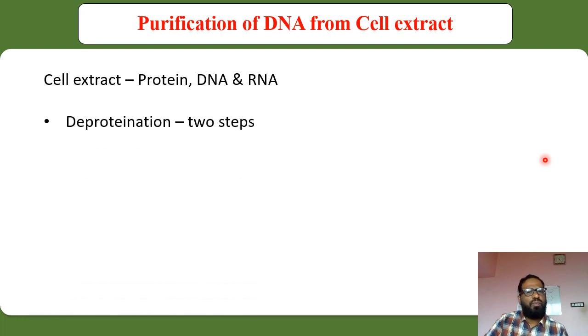Now, the first step is to remove the proteins. In order to remove the protein, we have to go for a step called deproteination. Deproteination is the process of removal of the proteins. The name itself gives the meaning. There is no problem in that.